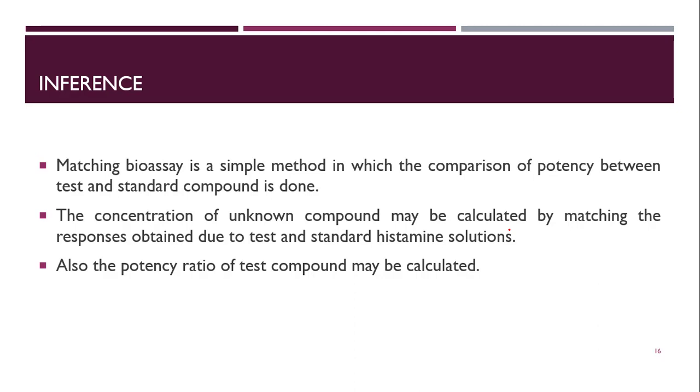Then also the potency ratio of the test compound may be calculated. So what we are getting from this particular method is that we are able to find out the concentration of the test sample, as well as the potency ratio of the test compound to the standard, by a very easy method.